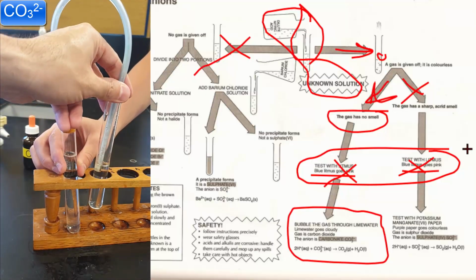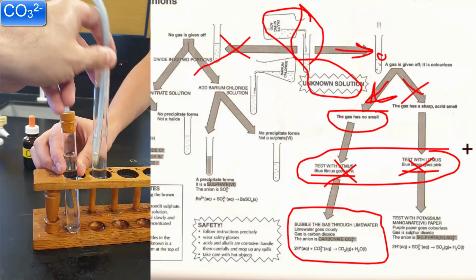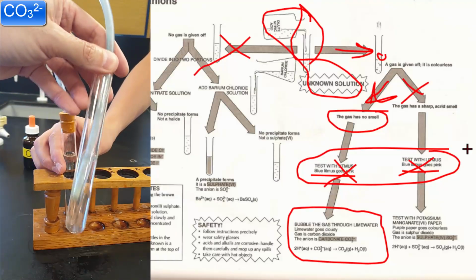Okay, so hopefully you've got enough skills now to be able to work out all the different anions and cations of all the unknown solutions.